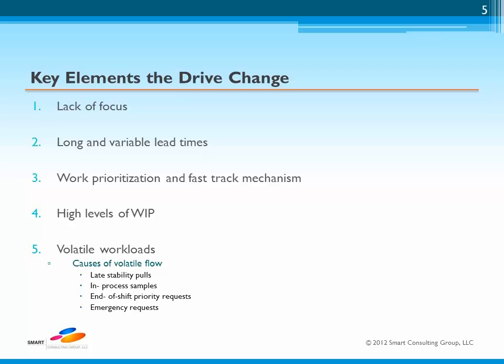Added to this, there is often little control over the journey of the sample once processing starts, because the emphasis is only on the accuracy of that sample or the individual test to make sure it's run efficiently. Often one finds that it takes as long as it takes. Clearly, there are multiple areas of waste associated with this type of operation, and efficiency is frequently sacrificed as a result. A second key point refers to long and variable lead times.